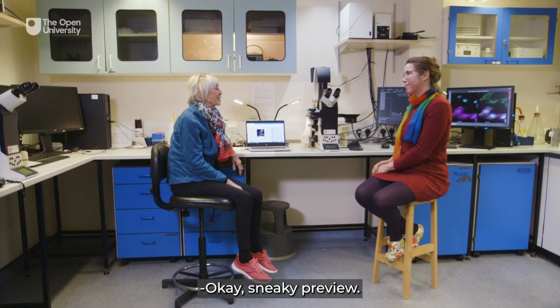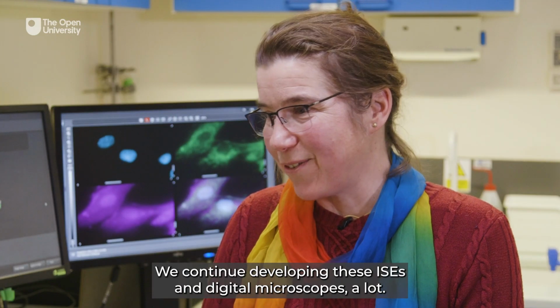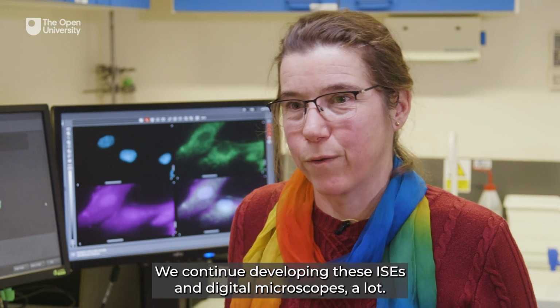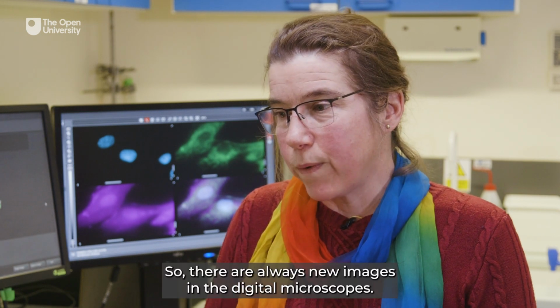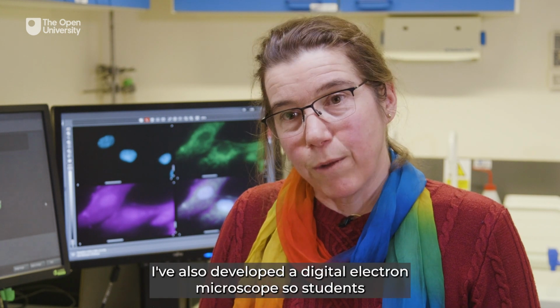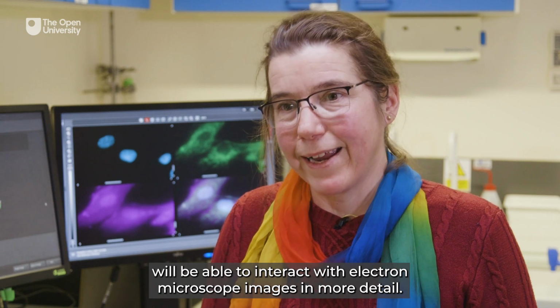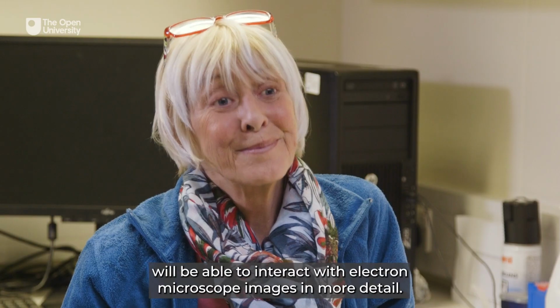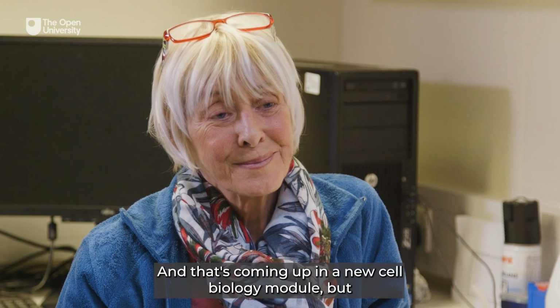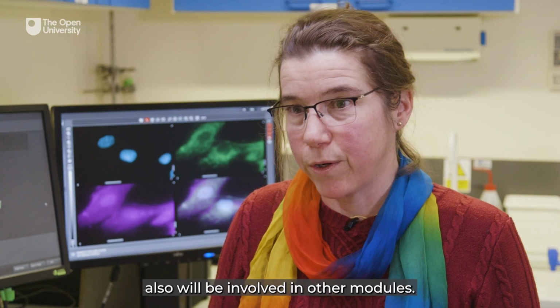Okay, sneaky preview. What have you got coming up? Plenty. We continue developing these ISEs and digital microscopes a lot. There are always new images in the digital microscopes. I've also developed a digital electron microscope, so students will be able to interact with electron microscope images in more detail. That's coming up in a new cell biology module, but will also be involved in other modules.